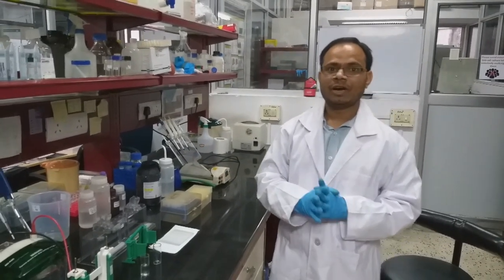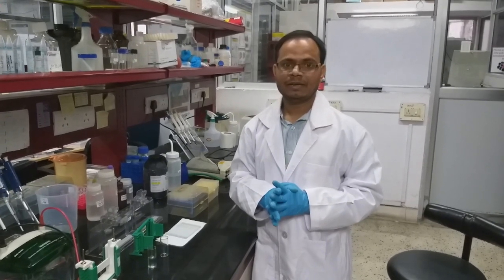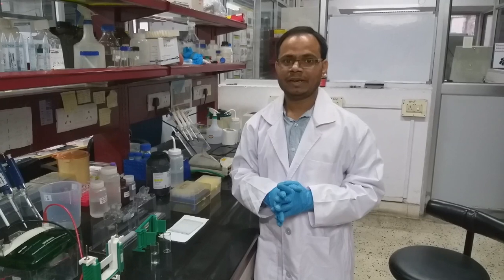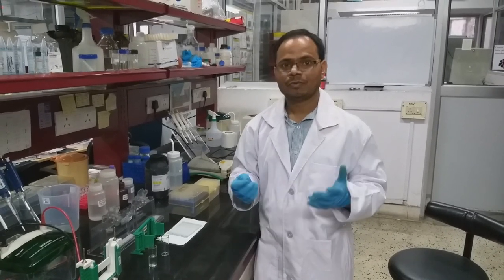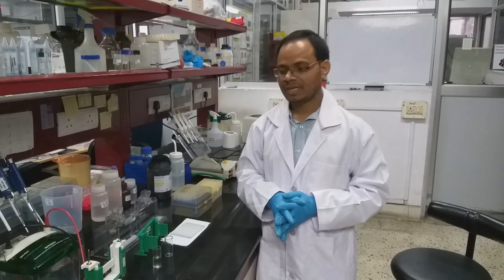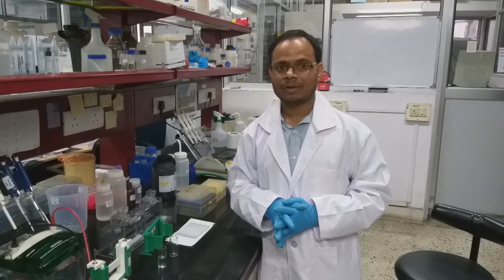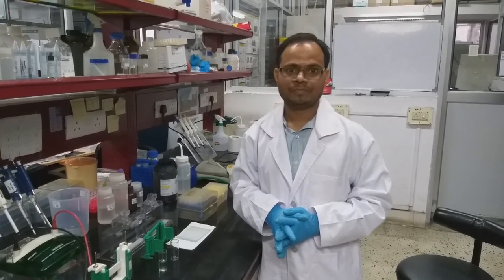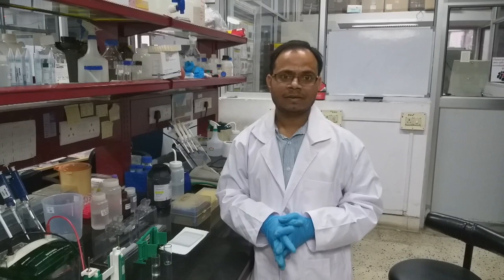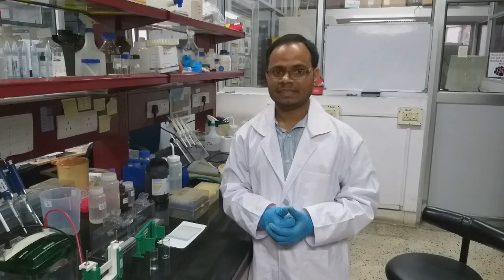After this we have to prepare the resolving gel. For resolving gel we need 1.5 molar Tris HCl pH 8.8. In addition to that we also need 10% SDS prepared in double distilled water, and also 10% ammonium persulfate and also TEMED. The role of the ammonium persulfate and TEMED we can see during preparation of the gel. They act as a catalyst.